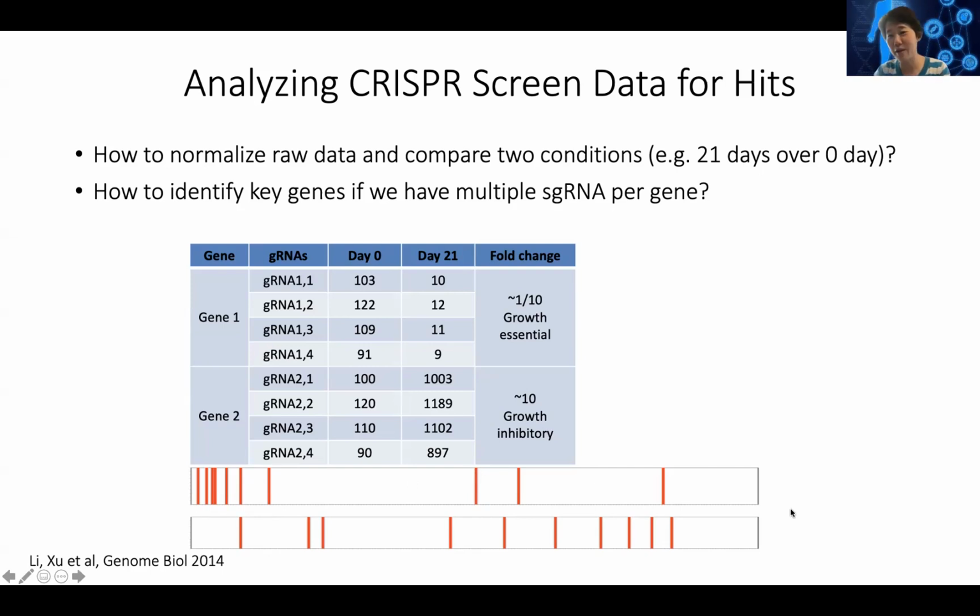and we ask whether those genes are overall skewed to the downregulation or upregulation. Using that, we can see whether overall you see a signature or pathway upregulated or downregulated. In this case, we're using a non-parametric order statistics to give us a p-value. And in the homework, you will be using some of that to look at a CRISPR screen.